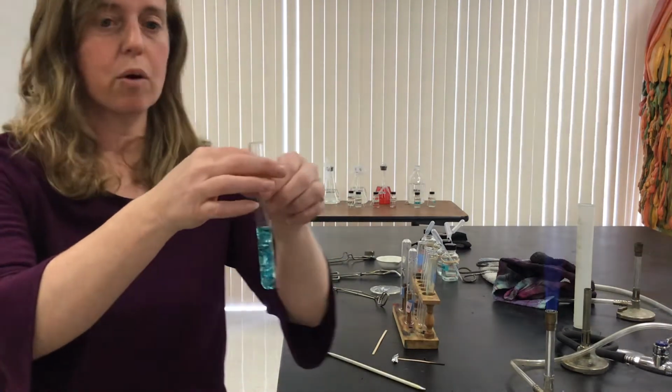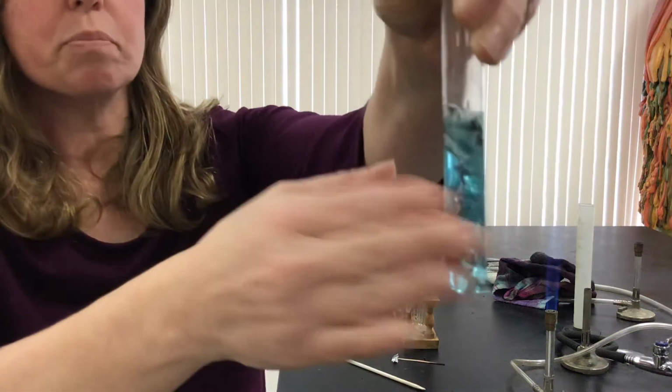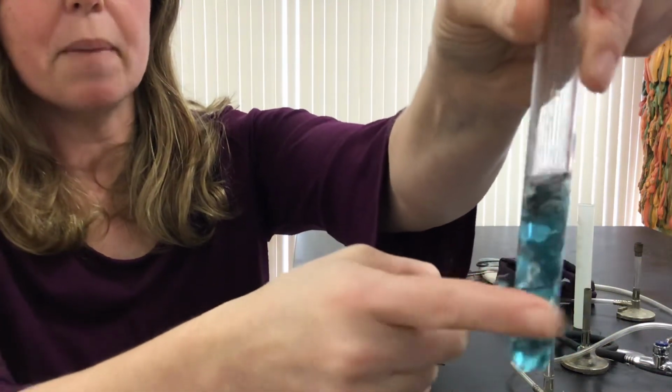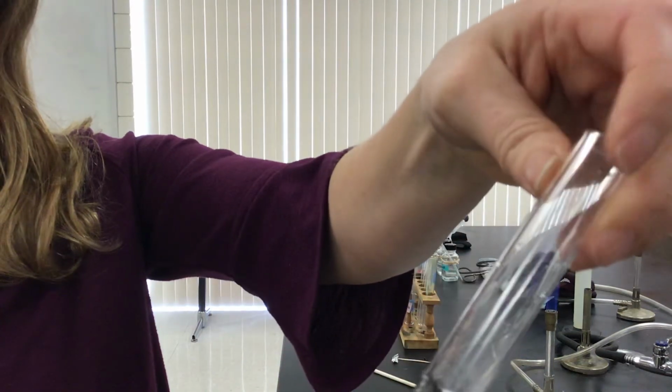Watch what happens. If I hold this up here and I start hitting it, you'll notice that it's bubbling, okay? You can see it bubbling a little bit, and now you're going to see the color, okay? You're going to see this little copper color that's starting to form. So what's happening is the copper is actually coming out of solution, attaching to the aluminum foil, and some of the aluminum foil is dissolving into solution. So you'll notice that the color of blue is actually changing because we're making aluminum chloride and pure copper, okay, because that's our products.